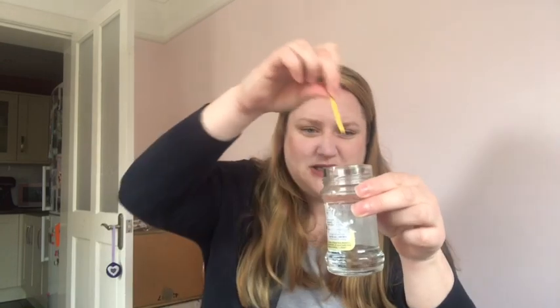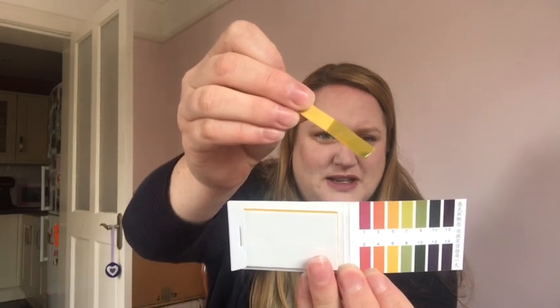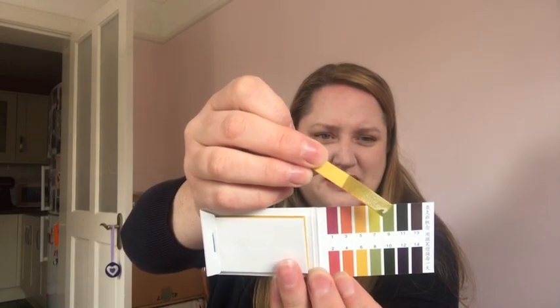Some good old-fashioned pH paper, which I'm sure you've used before. Just to make sure it's going to work for us, we're going to do a little test. I've broken out a couple of little slips from it. This is just some tap water, which should go a lovely pH 7 colour. pH 7 is neutral, so we're looking for it to go green, and you match it up to these colours, so it's turning a greeny colour between those two.